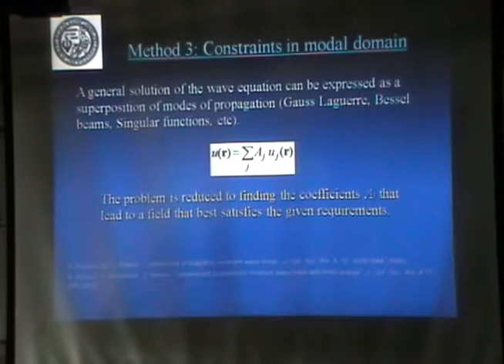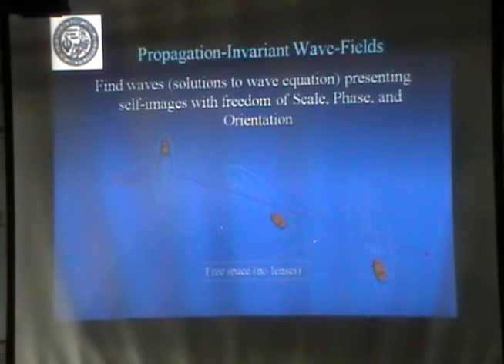So then you say, okay, well now my problem is I have this representation in Gaussian beams, and the only thing you need to find is the coefficients of each of them. And there are at least 2 ways of decomposing into these Gaussian beams. If you use Cartesian coordinates, you get the Hermite Gaussian beams. If you use polar coordinates, you get the Laguerre Gaussian beams. Some look like squares, the others look like donuts, rings. We're going to see those in a moment.